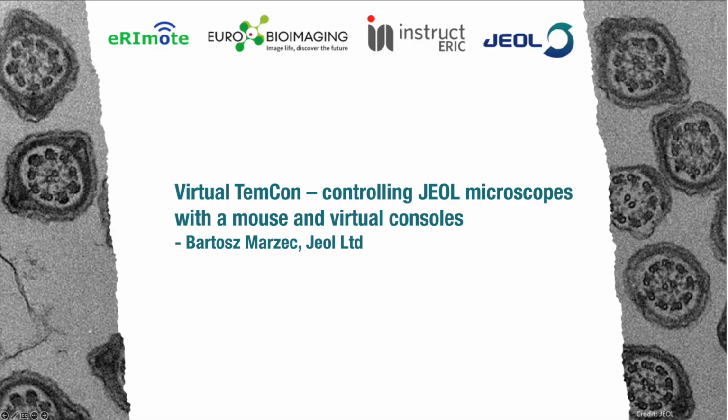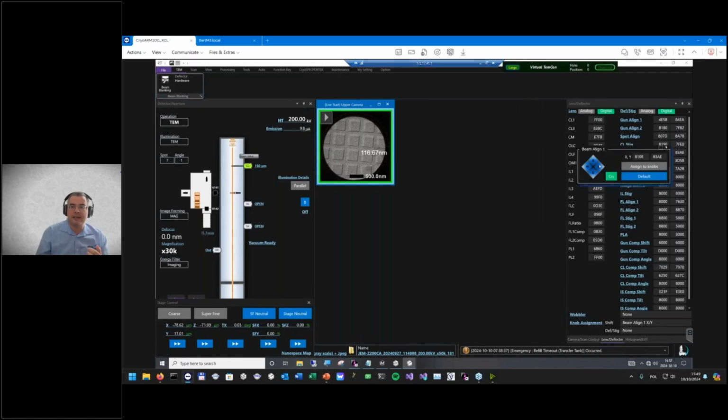Saying this, we've got customers telling us that using these arrows is not necessarily the best idea because it may require you to do quite a lot of clicking. Also, older versions of TemCenter were not that interactive, and we were asked whether we could come up with a solution that could allow people to control the microscope in a more intuitive way.